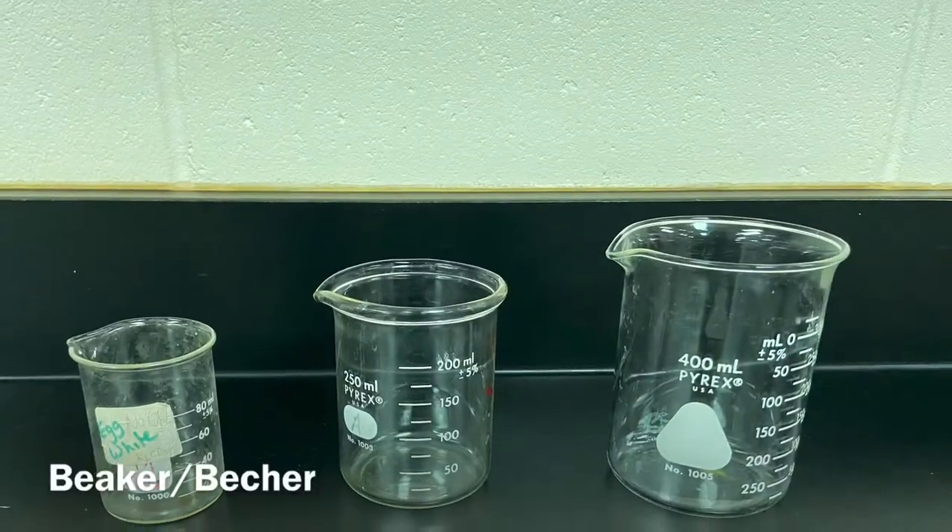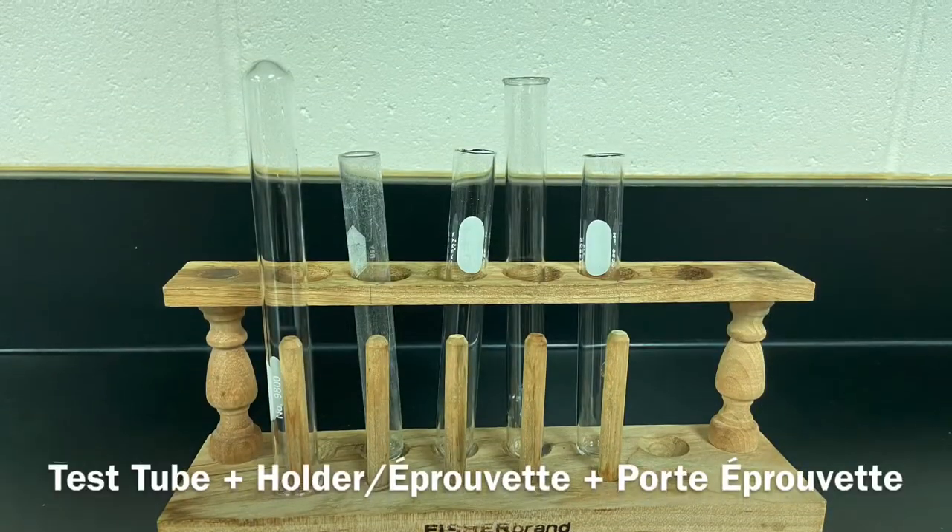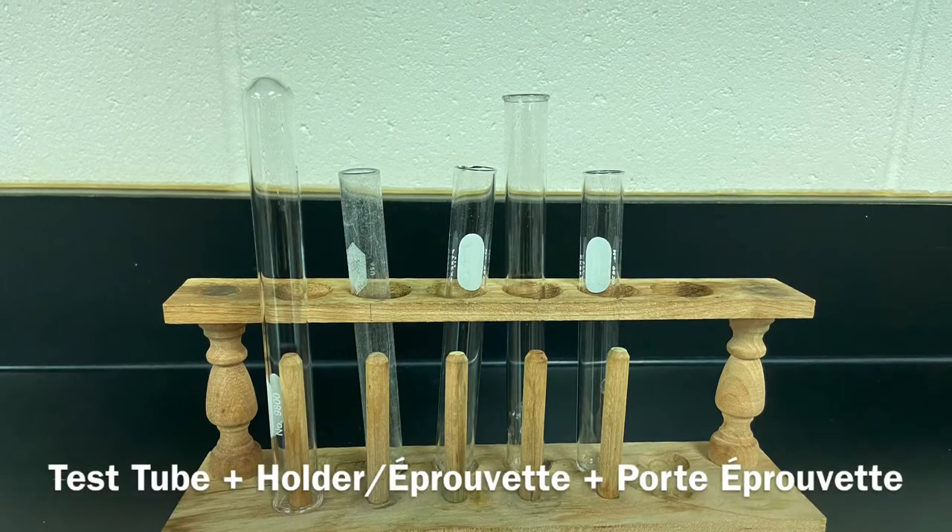Beaker. Bécher. Test tube and holder. Éprouvette et porte-éprouvette.